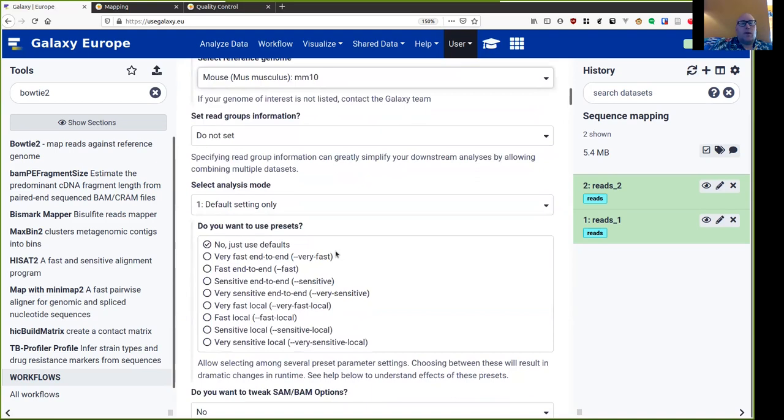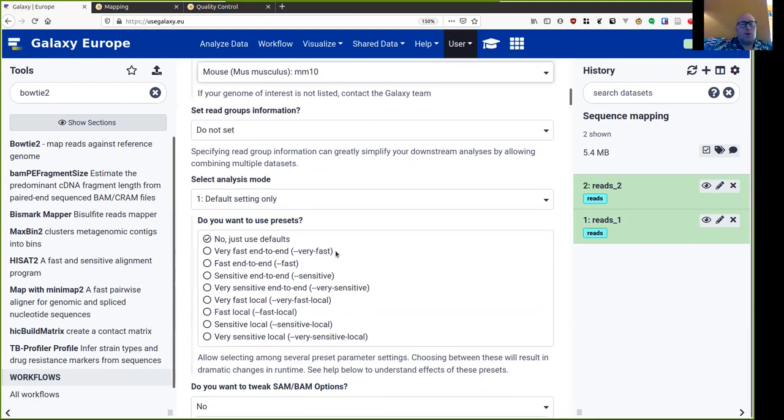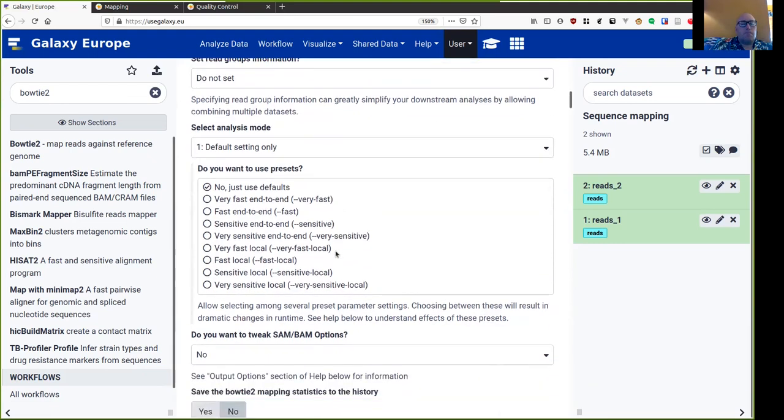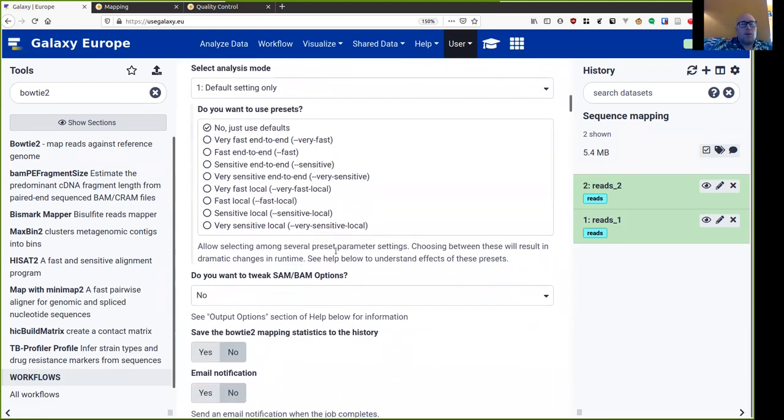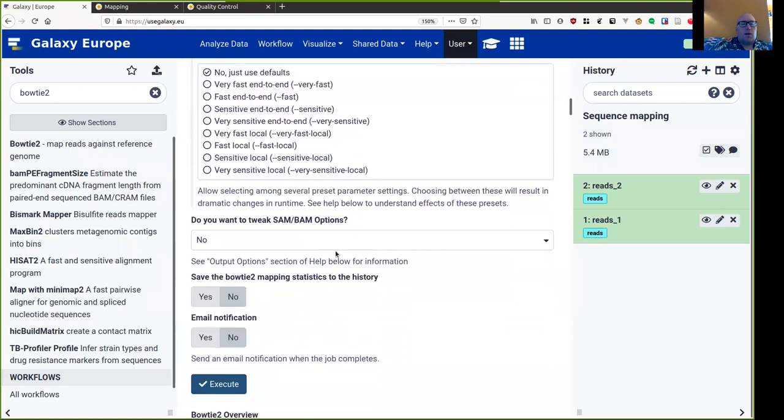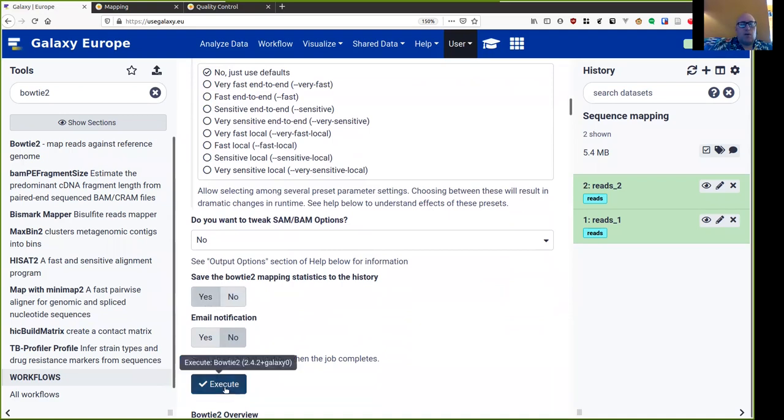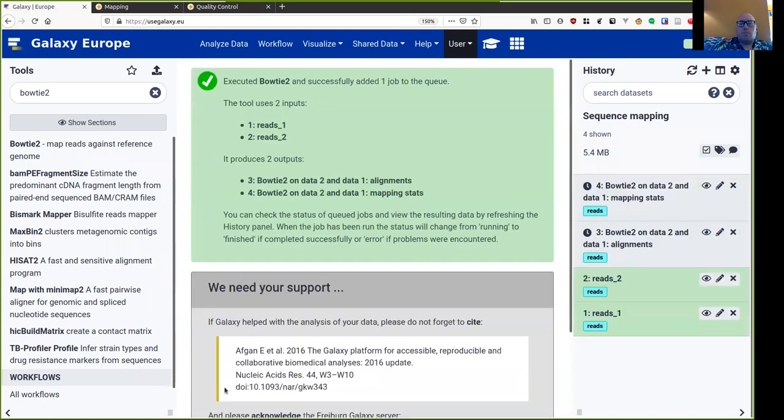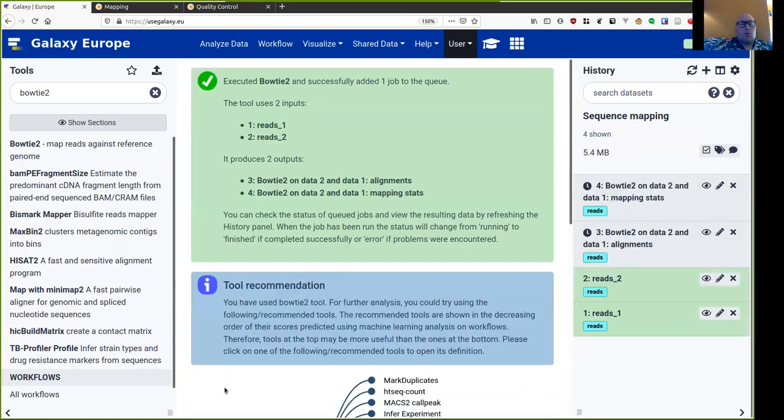The next question is about read group information, which is how to tag the alignment in terms of which data set it came from. This is very useful if you are dealing with multiple data sets, but we're not using it today. And then finally, I want to save the Bowtie2 mapping statistics to the history. So I can know a little bit about how the mapping has proceeded. Having done all of this, I now hit execute.